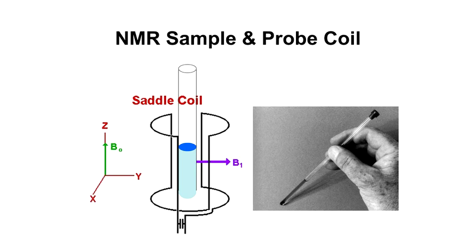So in NMR, we're mostly working with liquids, and the liquids are housed in tiny little tubes. They're about as thin as a pencil, in these cases often thinner, down to about 3 millimeters is a common sample size these days. So you'll put anywhere between 100 microliters to 500 microliters in one of these thin, pencil-thin NMR tubes and drop it into the spectrometer and start collecting.